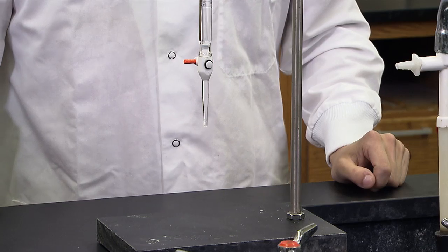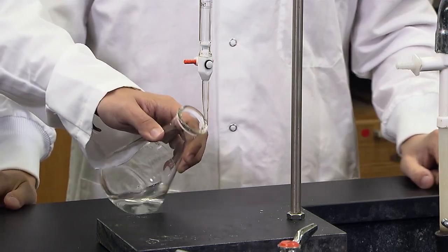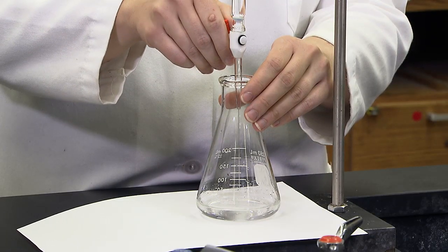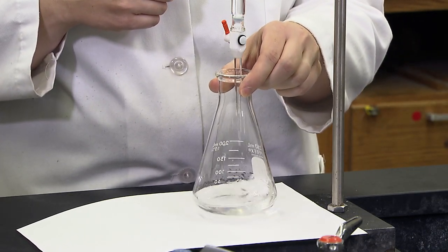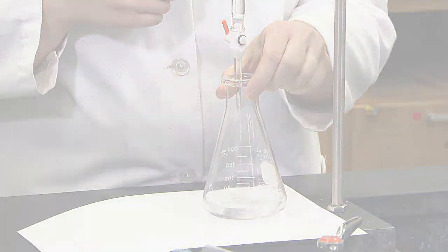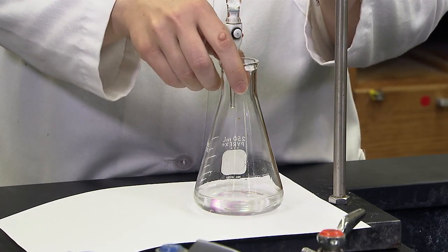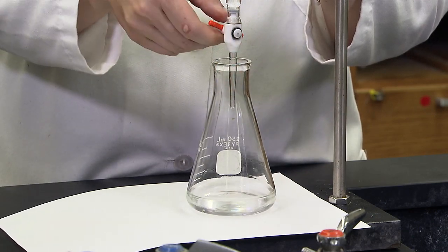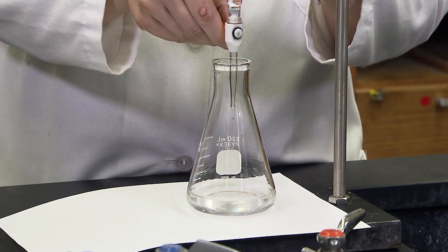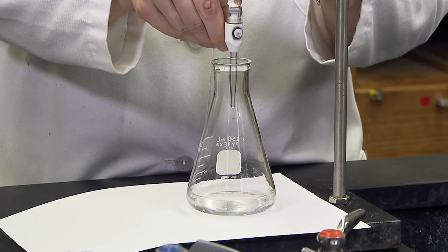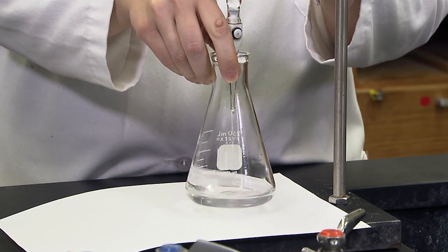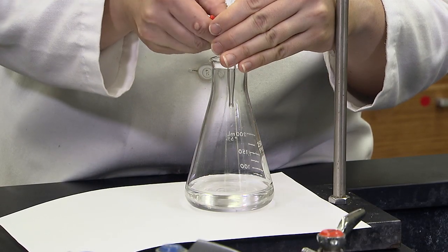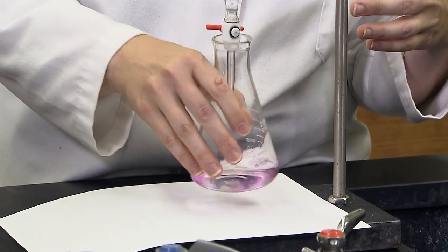We are now ready to titrate. A white paper will help us see the color change. You can add 1 to 2 milliliters of sodium hydroxide at a time and swirl, or you can adjust to a steady state of drops, swirling constantly. You can try either method. Just remember to add less sodium hydroxide at a time as the pink color starts to linger in the flask. Continue adding sodium hydroxide until the faint pink stays after swirling for 30 seconds.